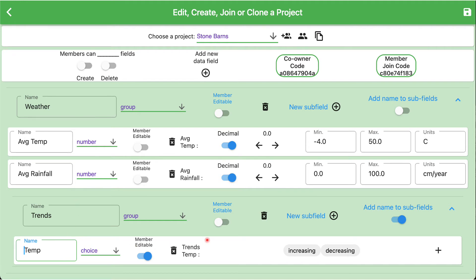One thing to point out is the option to add name to subfields. In this case, I have chosen to turn that on, and you can see that our group name is trends and our field name is temp. But since we're adding the name of the group to each subfield, this now gets the name trends temp.